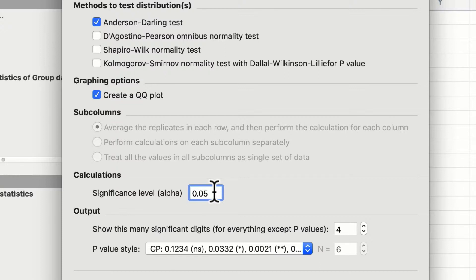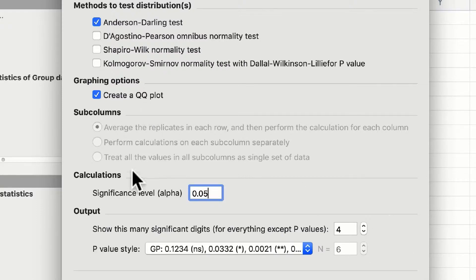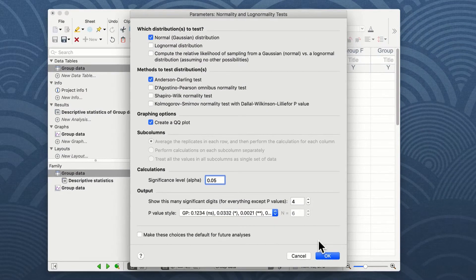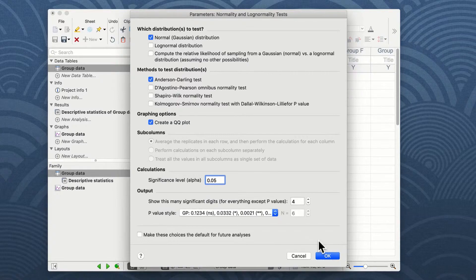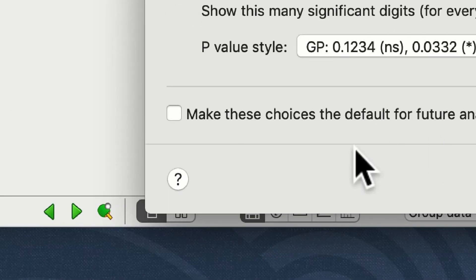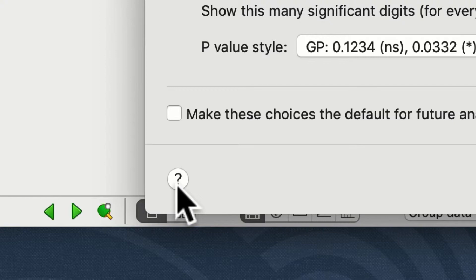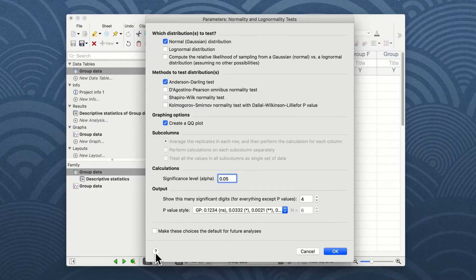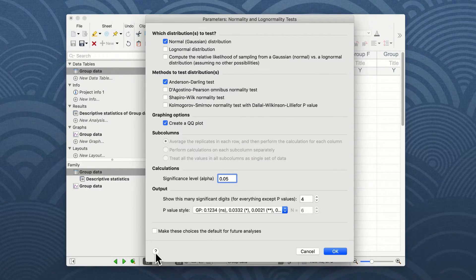We have an option to create a QQ plot, and we also have some other options on how to display our p-value as we do in other statistical tests. It is worth noting the little question mark down the bottom left of all of these option screens will bring up the very intuitive Prism help screen in order to understand further what these tests will be doing to your data.